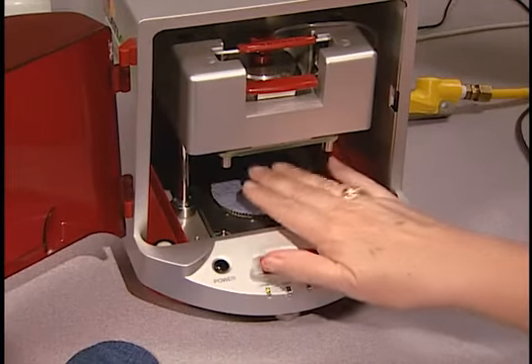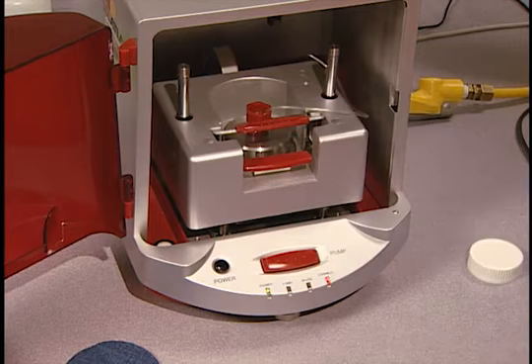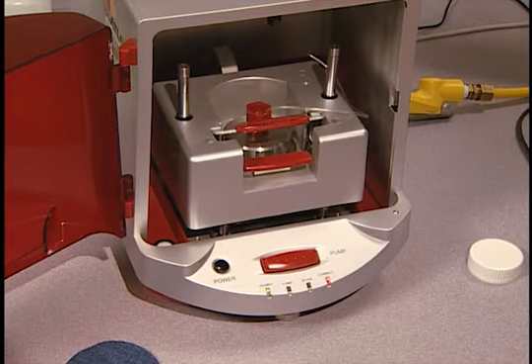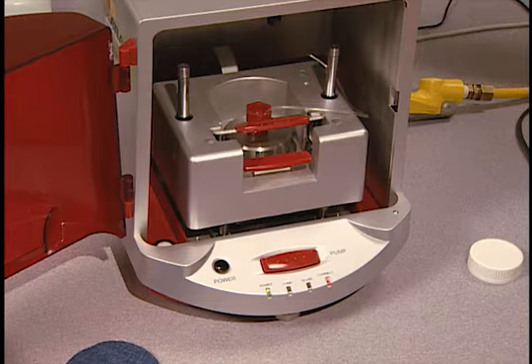The second noteworthy aspect of the test method is the application of the test liquid. An amount of 0.22 cubic centimeters of test liquid is delivered onto the back of the fabric specimen during a 20-second time frame. The specimen is sandwiched between two sensor fields, which allows measurements to be taken on both sides of the fabric.